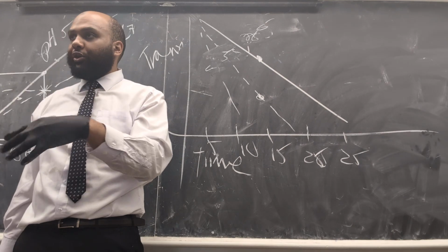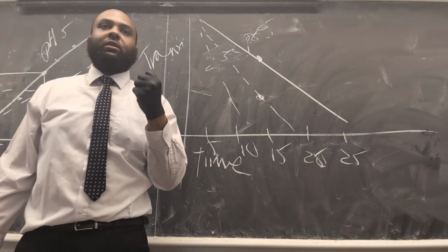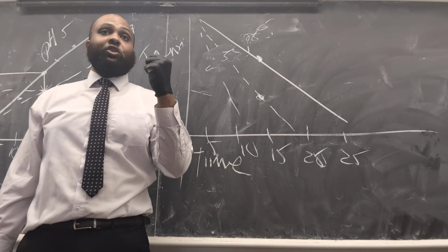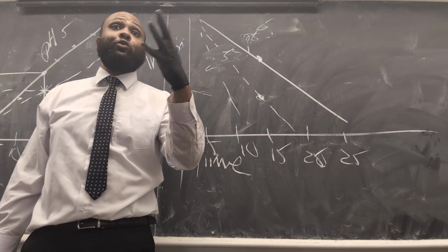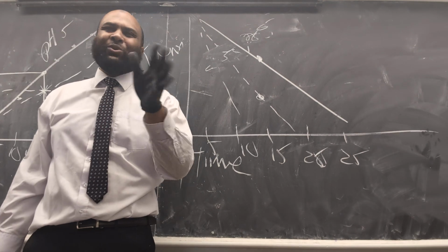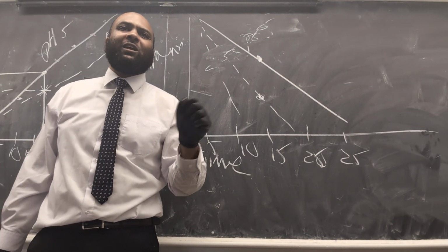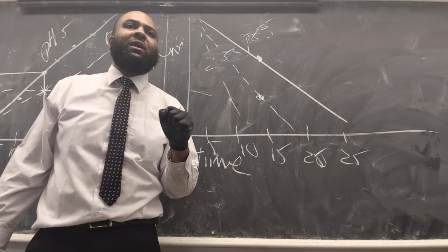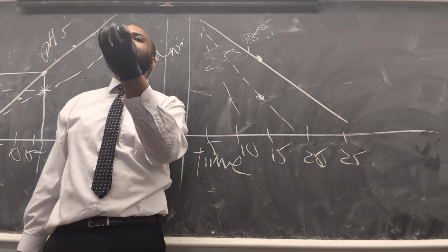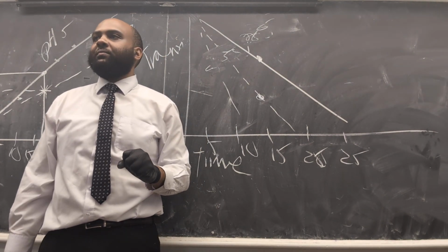The more you are at your optimal environment with a pH and temperature, as an enzyme, the more product you will produce, and you will absorb more light and allow less transmittance. But when you're not at your optimal, you will not have a lot of product, you will not absorb a lot, and you will transmit a lot of light. That's the key point of this lab.